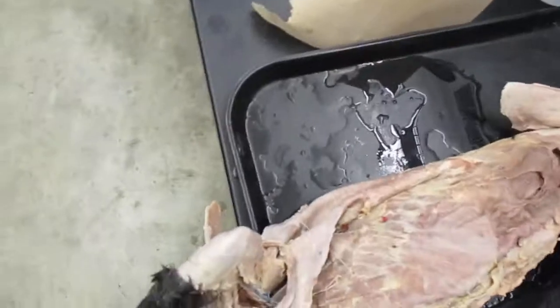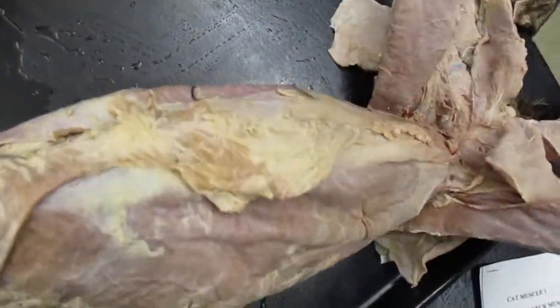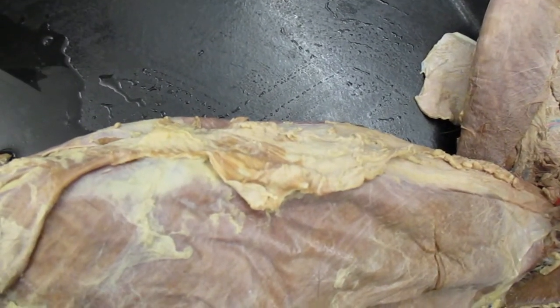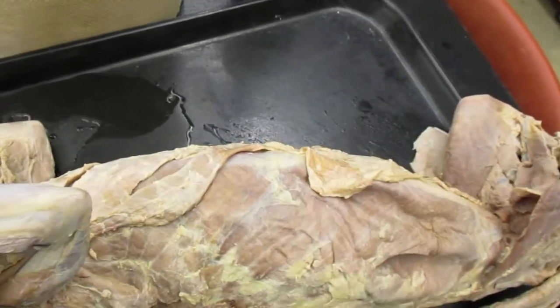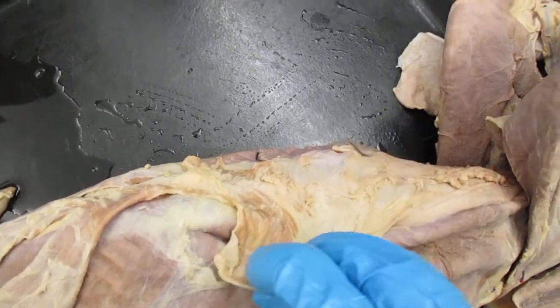Okay, I want to next show you the abdominal muscles. So, the abdominal muscles are a little bit tricky, and that's because of the way the skin is. You know, the skin and the fat and the fascia are going to mix in with the external oblique. So this is a remnant of the external oblique right in here. So the external oblique is going to pretty much cover all this area right in here, and it comes off with the skin. So this is your external oblique right here, right there.